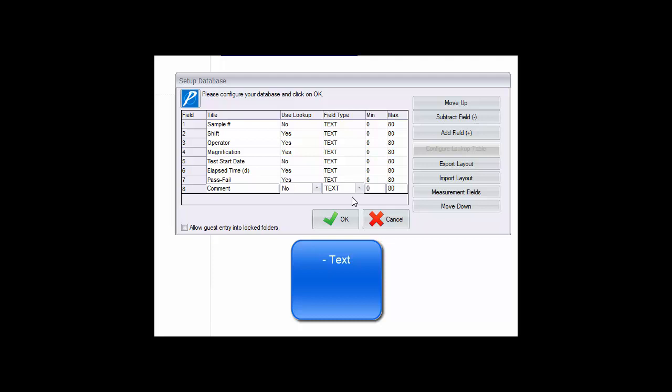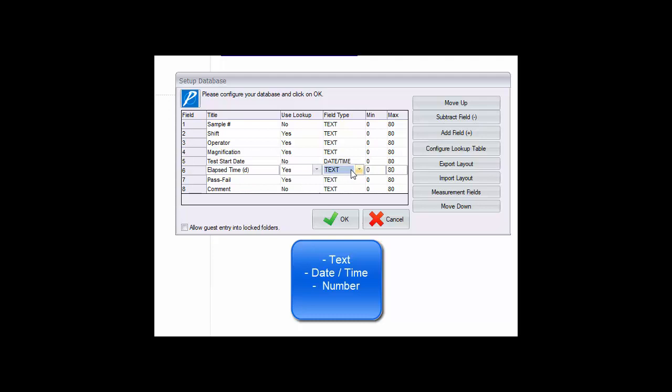Other options for formatting include date fields. When set for date, the field entry is not handled as text per se but ordered and sorted as a calendar date. Number fields are also available which format the data as a number that may be used in math operations.